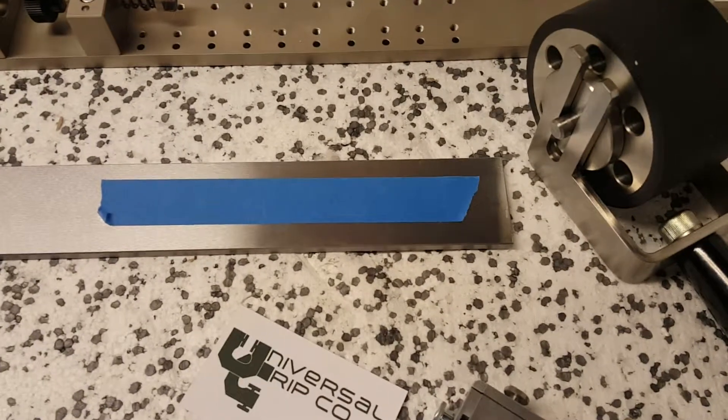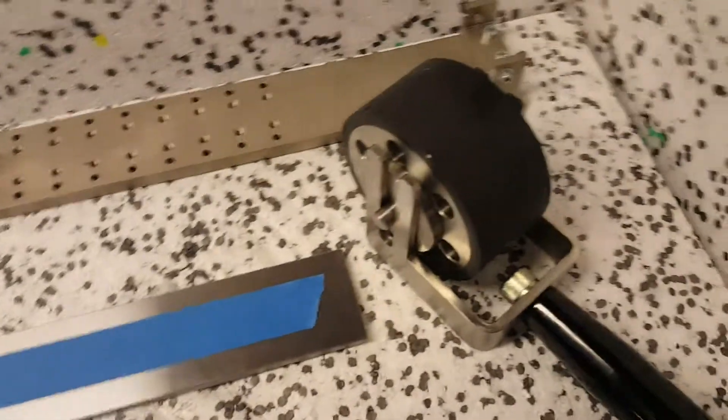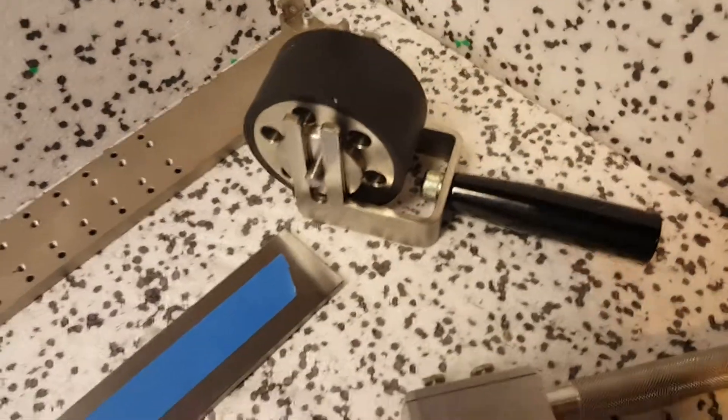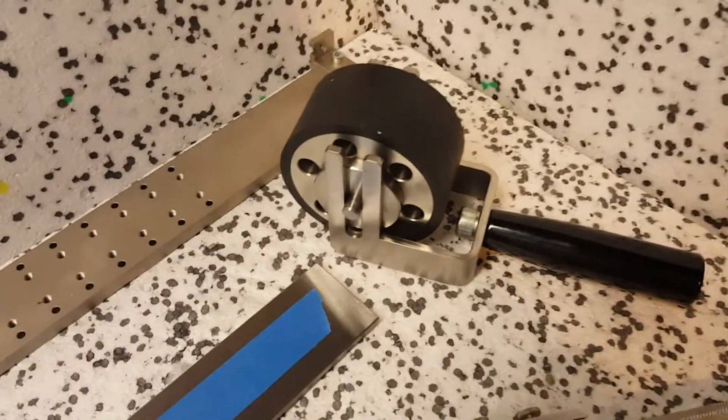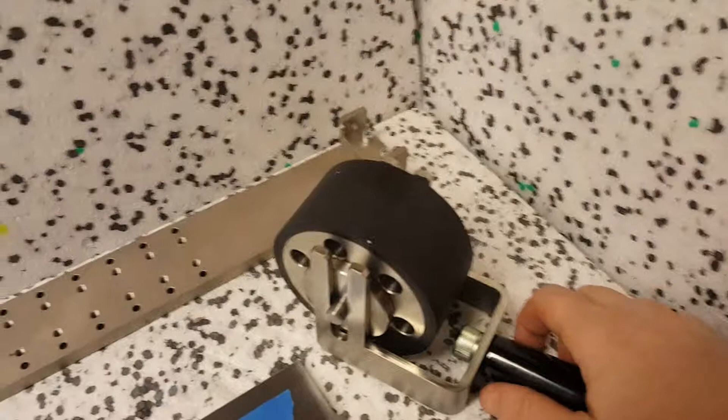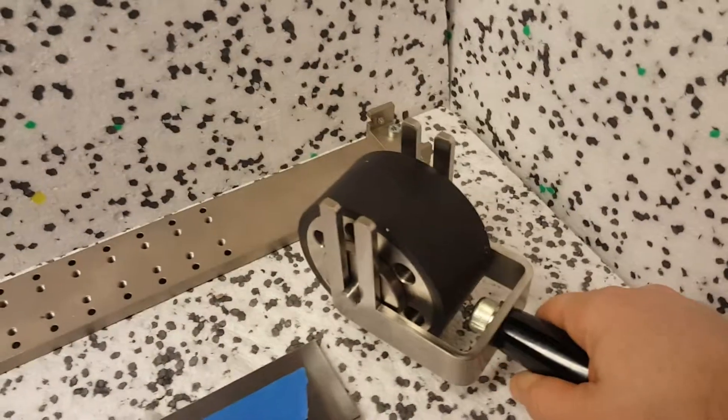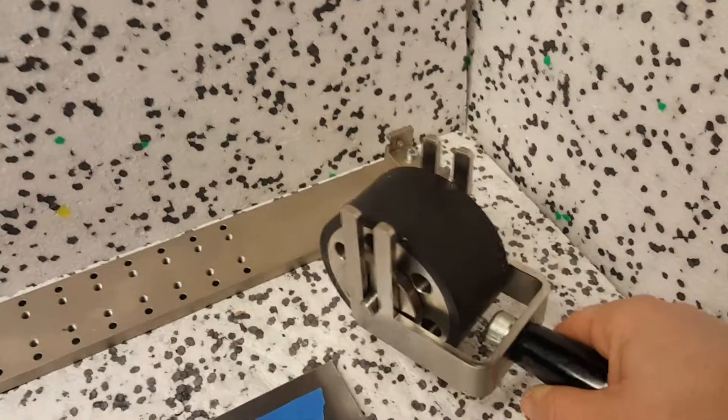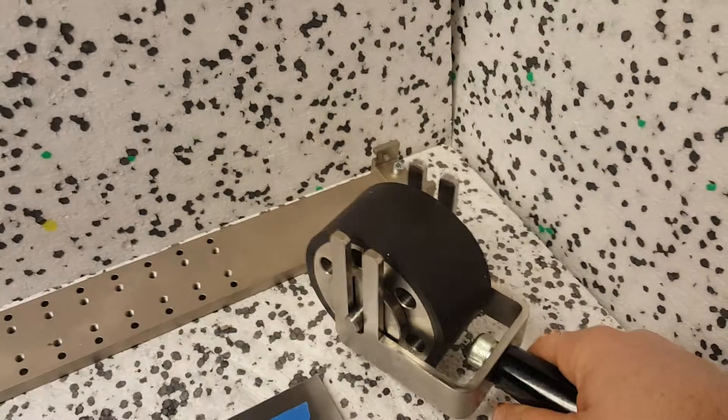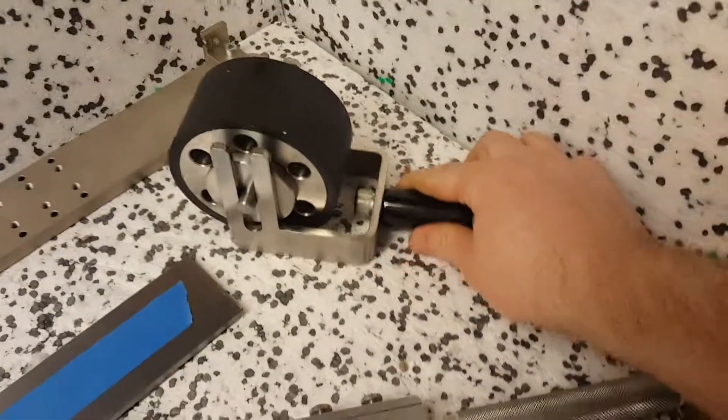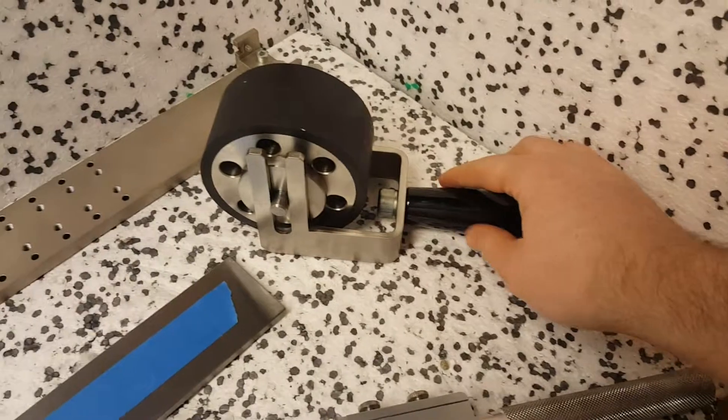The weight is exactly according to the ASTM. It comes with this nice handle where you can't impart any extra force because it just slips up like that. Also, it's a nice square design so it doesn't roll off the table or fall.